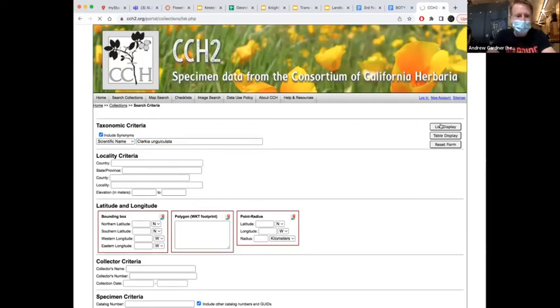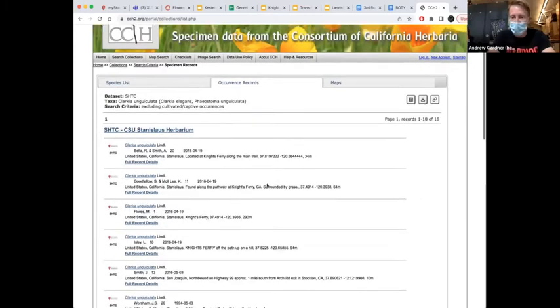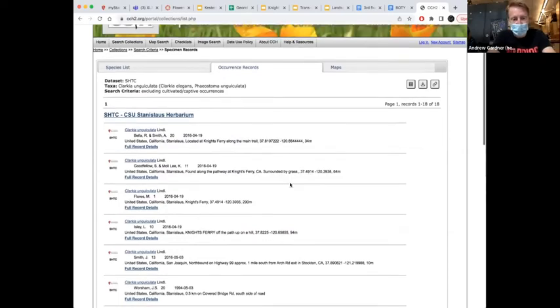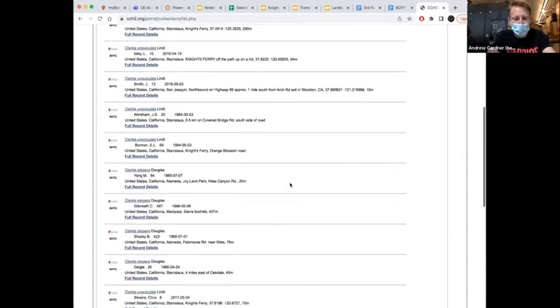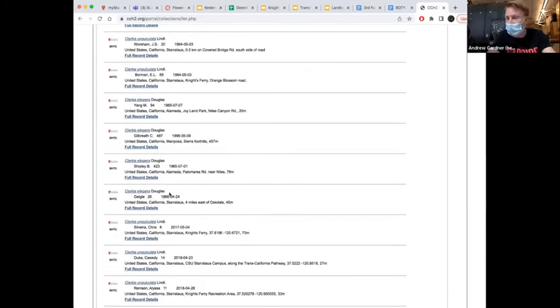List display. Now, what we can see here is that in our herbarium, we have 18 samples of this Clarkia species. And these are samples collected in different years. So here's one that was collected in 1966. And right after that, one collected in 2017.